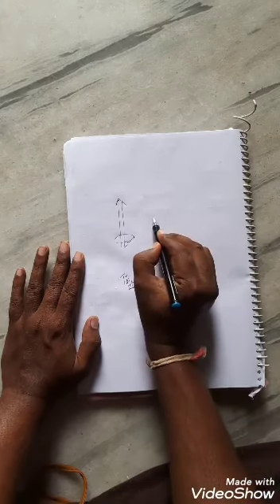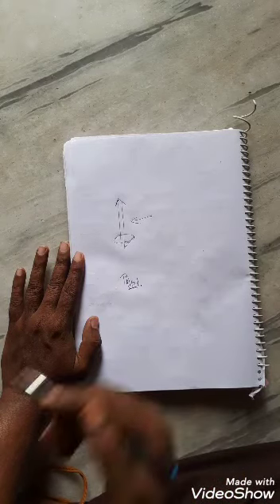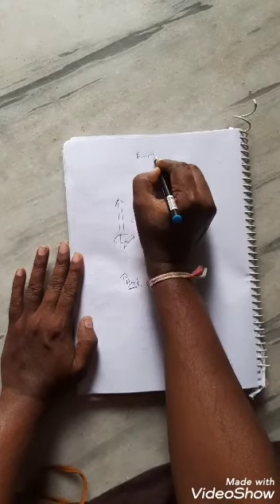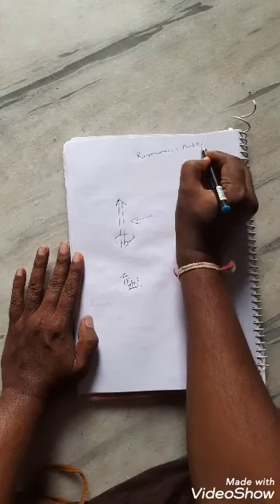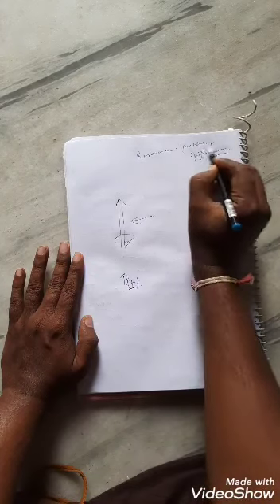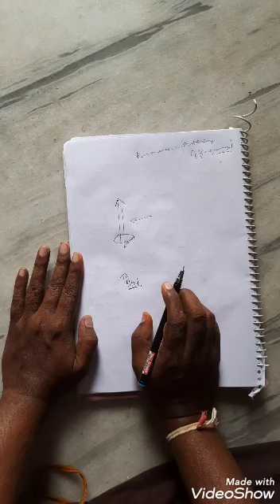At resonance conditions, here also resonance is equal to matching of frequencies, when the frequency of the applied radio source energy is equal to the precessional frequency of the nuclear magnet.